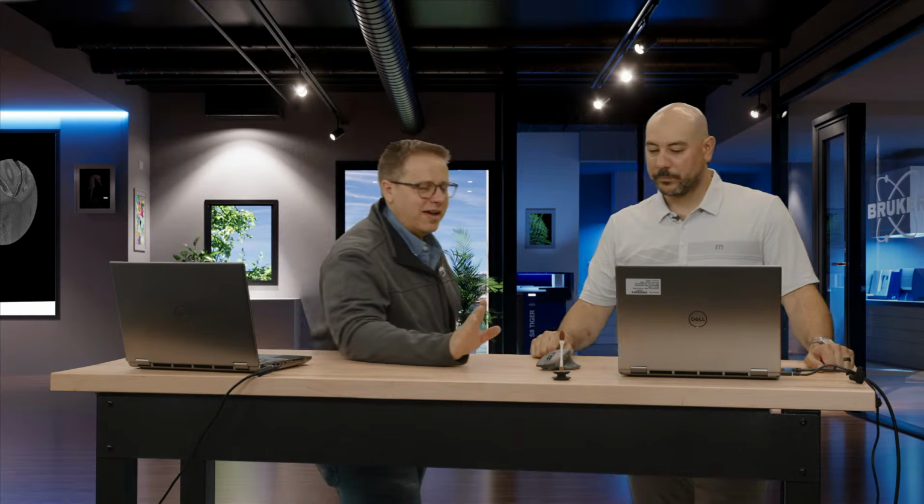All right. Now let's say I have the same size, but it's a 3D printed plastic sample. 40 or 50? 40 or 50, so we go lower. But what if I'm measuring styrofoam? You actually use styrofoam to mount things because it's so low density. What if we have something with very, very low density like that? What kV would we be using there?